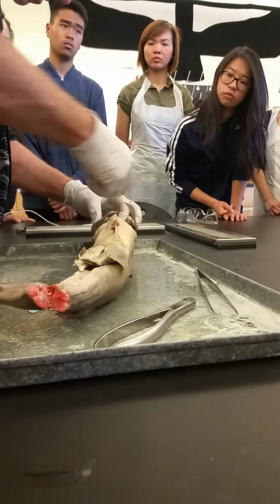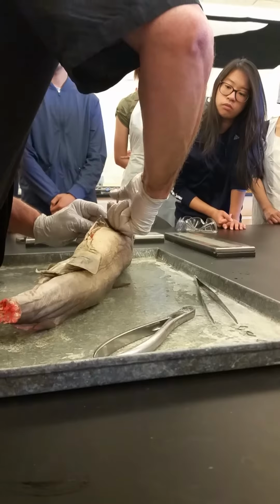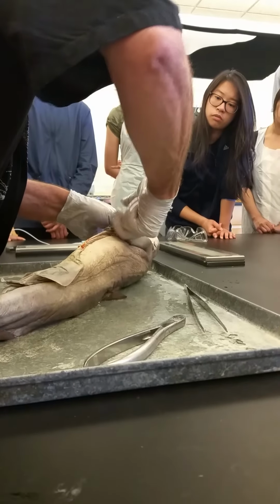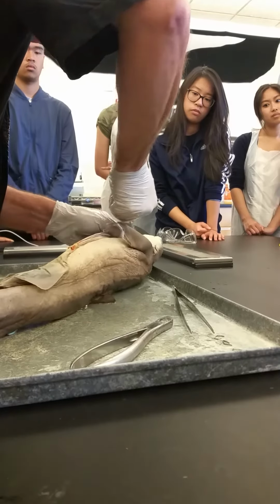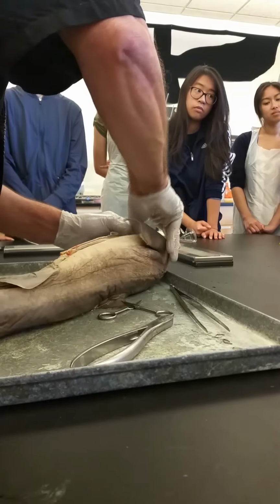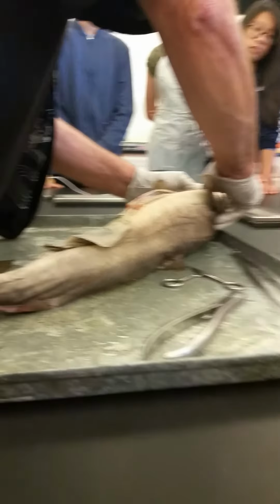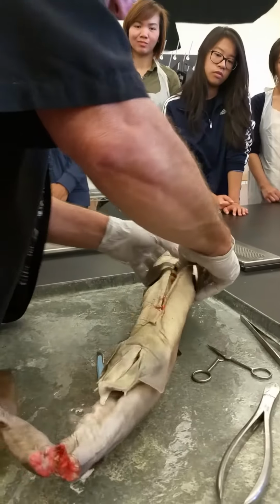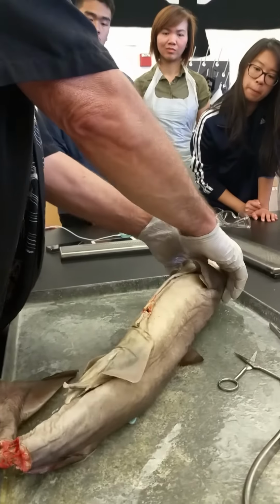Got here. Okay, so we get up here between the gills, that's where you're going to find the heart.